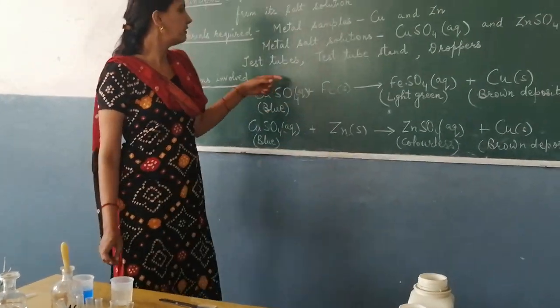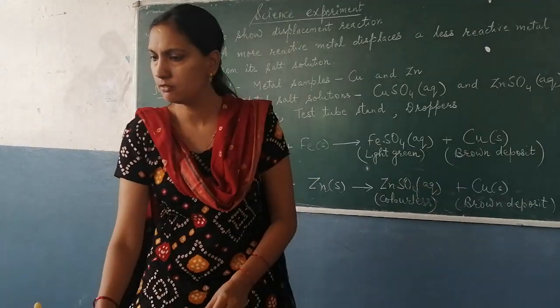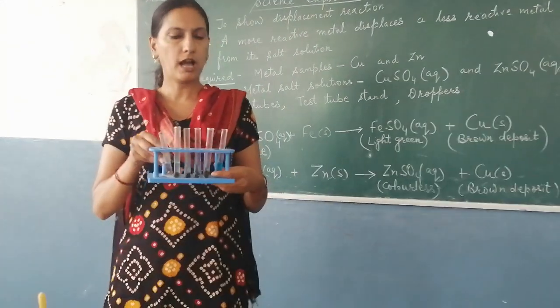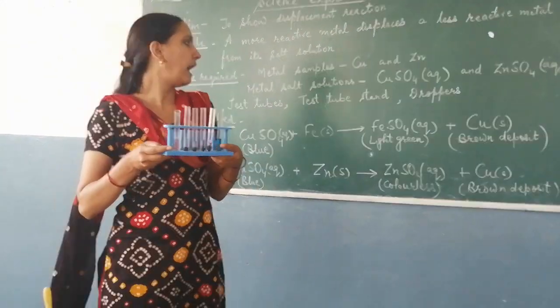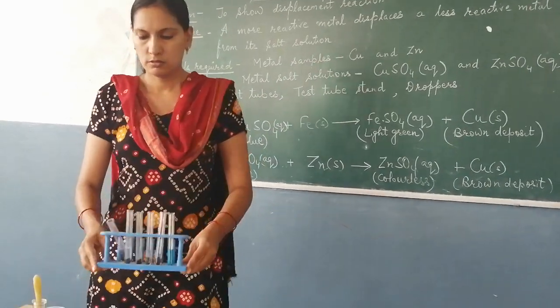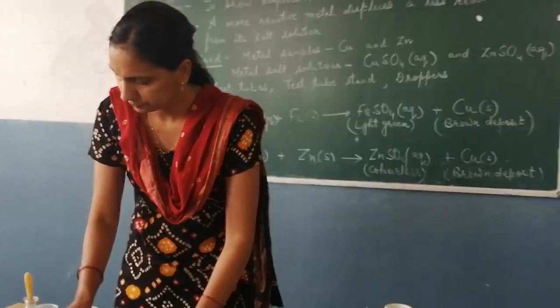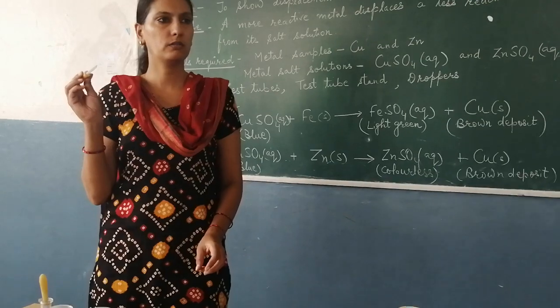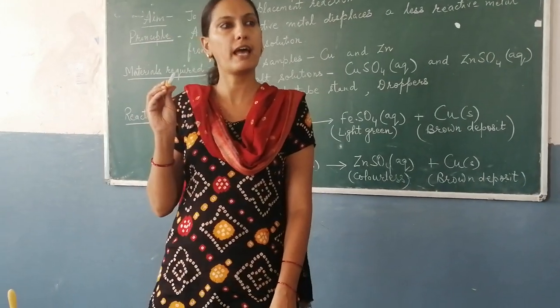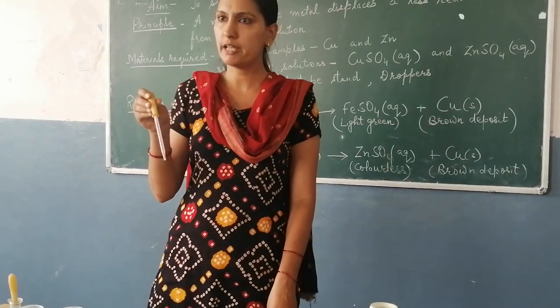Next we require test tubes. We have some test tubes here. You can see the test tube stand and droppers. This is the dropper. With the help of this dropper, we can take acid and put it into the test tubes.